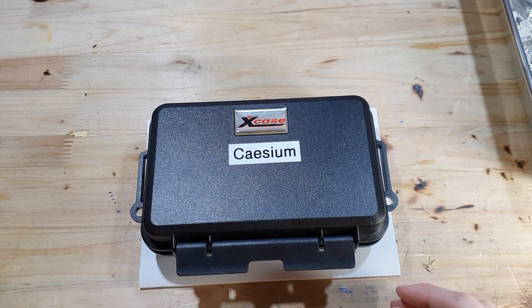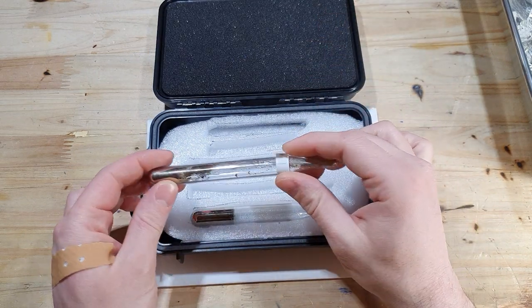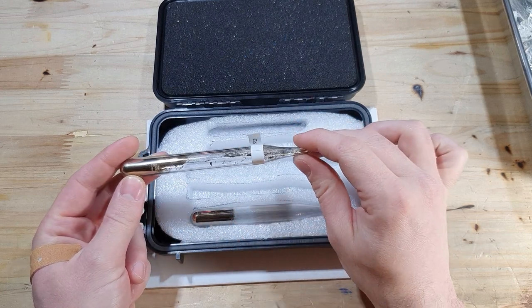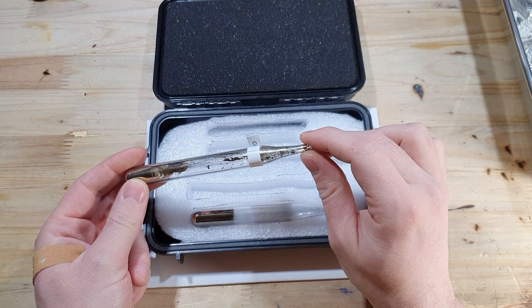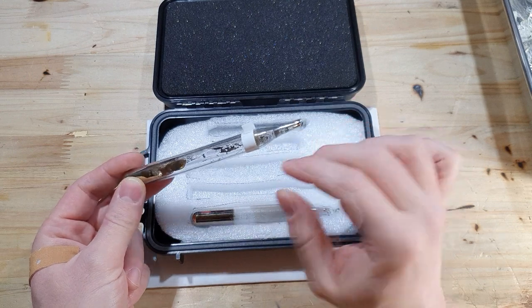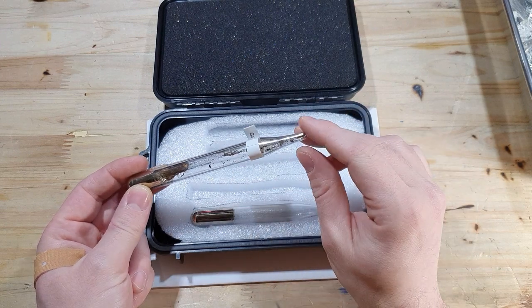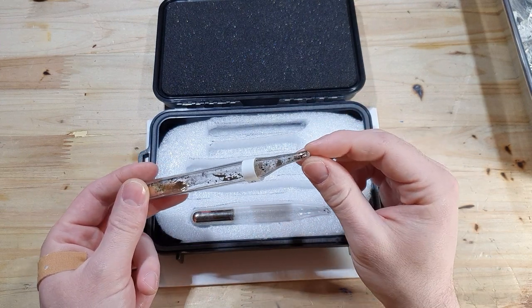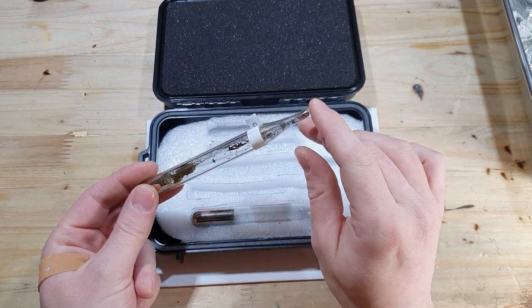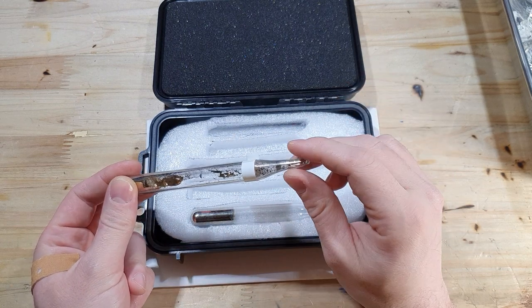So why use a brake seal? If you've got a product — for example cesium — that is sensitive to moisture and oxygen, and you've got it in an ampoule like this under vacuum, and you want to transfer it into another apparatus, for example to redistill it or use it for another purpose, you've got a problem. There's no easy way to transfer the cesium from this ampoule into another apparatus without getting it into contact with air. You could freeze the cesium and open the ampoule and get a little bit of oxidation on the surface, but there are cases where that's not an option — so that's where brake seals are very handy.